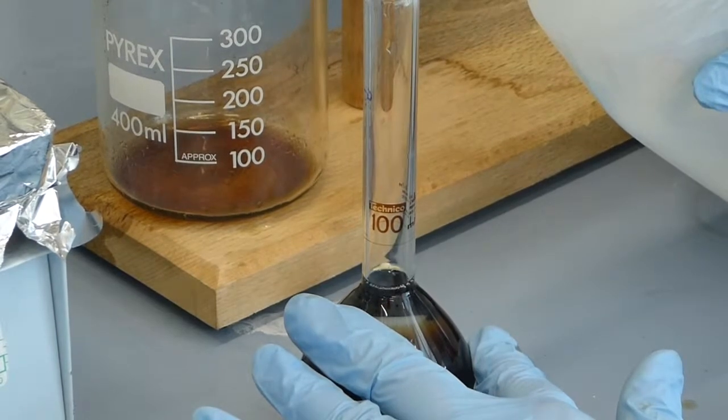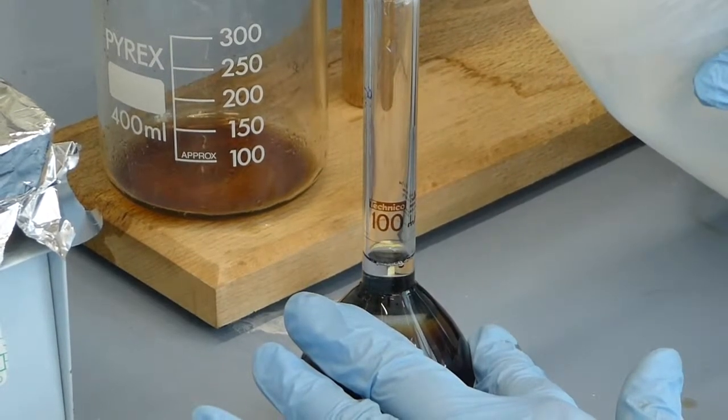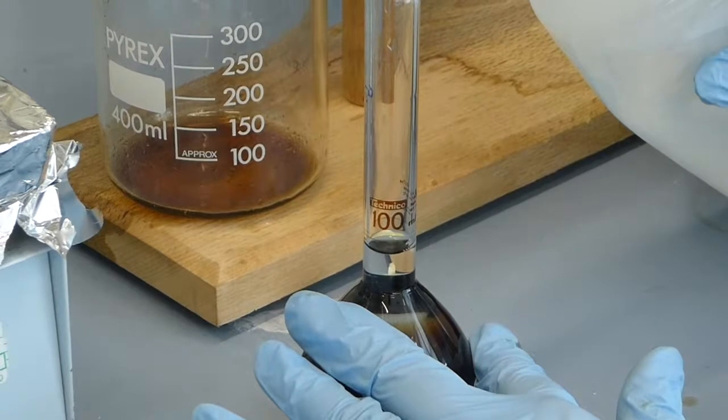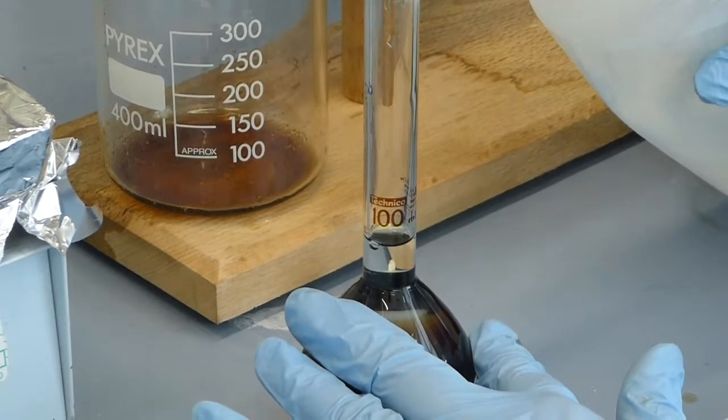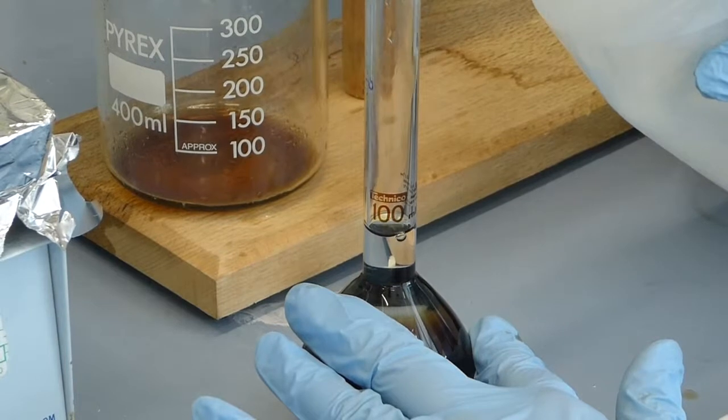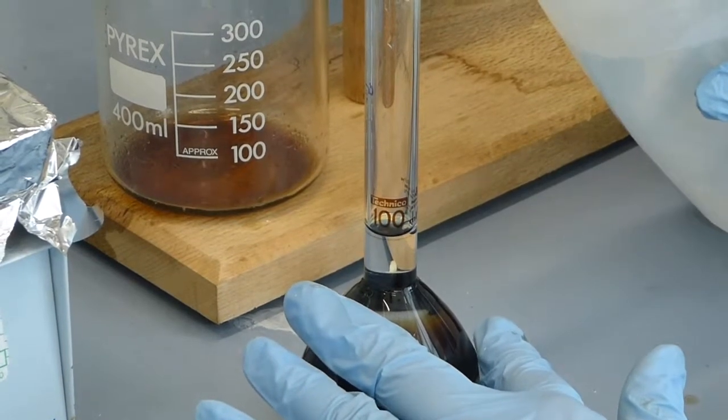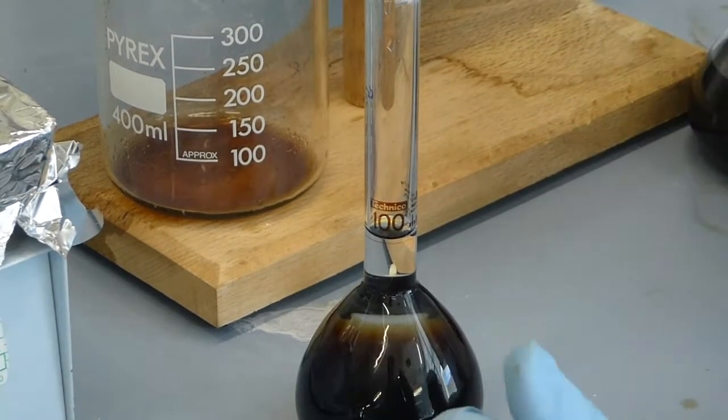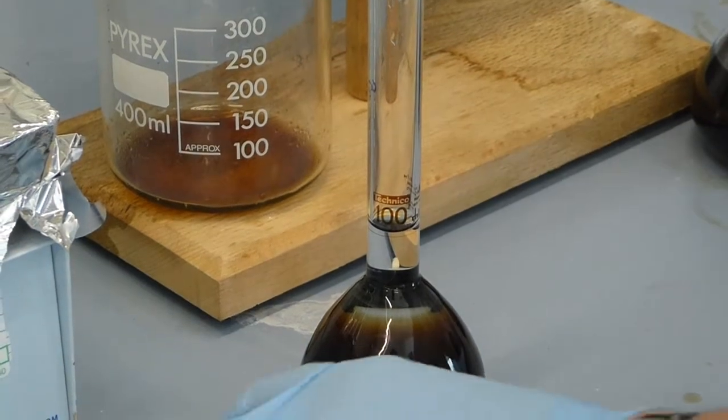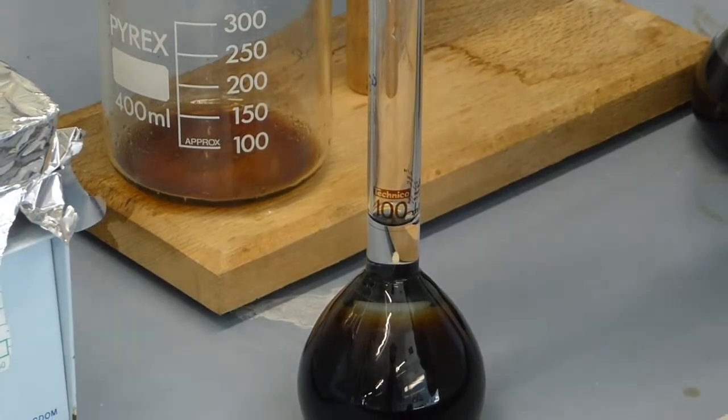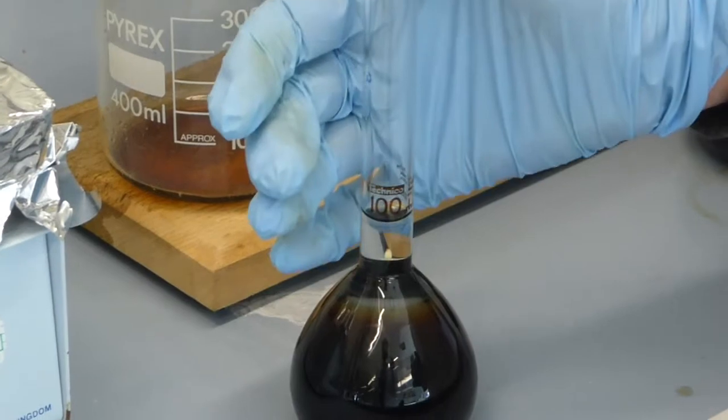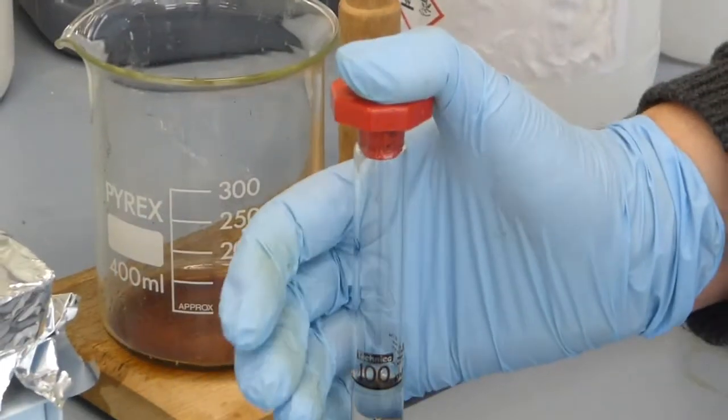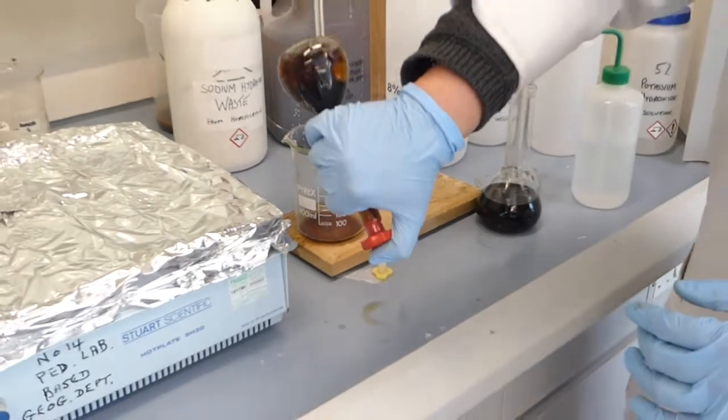And then you want to top up with distilled water up to the 100 ml line. Again, you need to be accurate with this. Stopper the volumetric flask and invert several times because again you want this solution to be mixed.